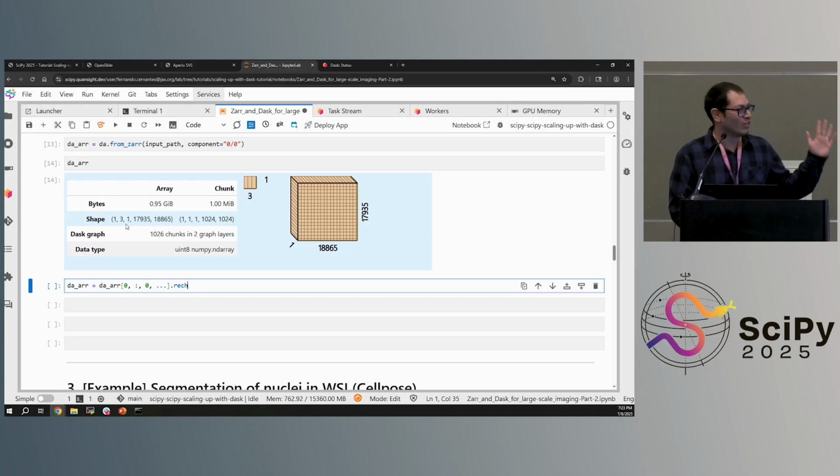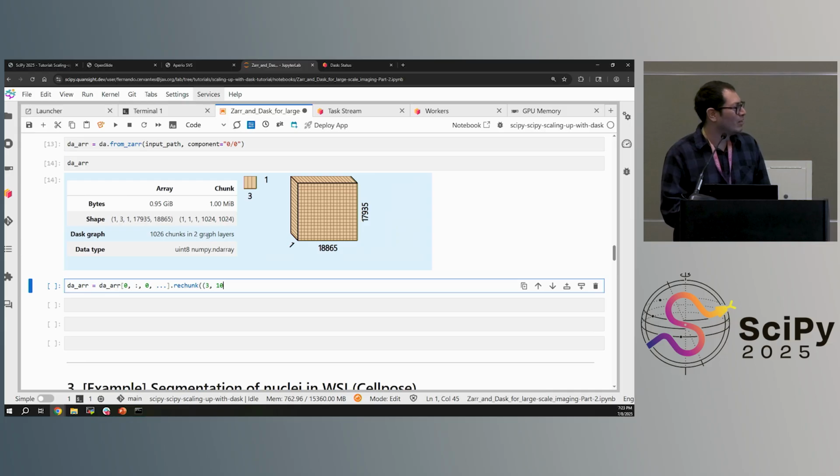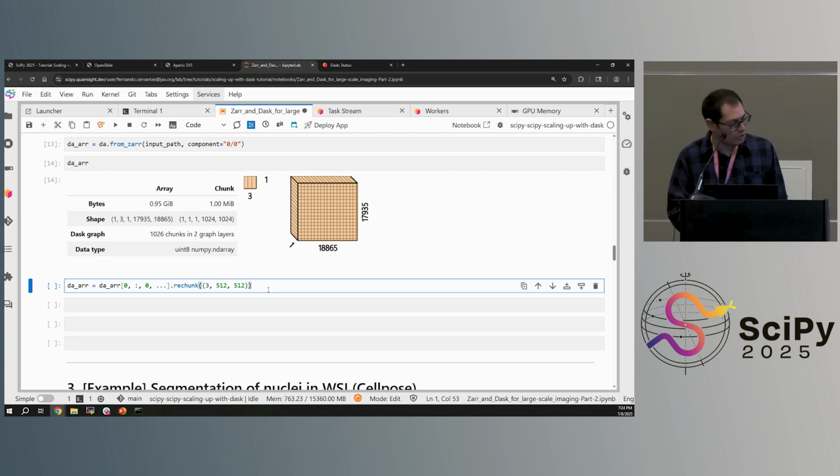So probably if you choose a chunk to the right or a chunk lower, you're going to get more tissue there. Good point, just to do that to show the result better. So I took this selection from here, it's probably one below that. I'm running the selection again. I don't have to run this because we have already created that function, but we need to rerun this because it is applying to the Dask selection.